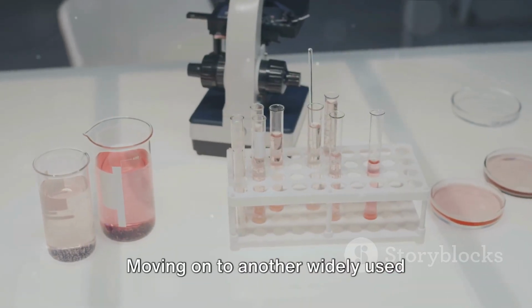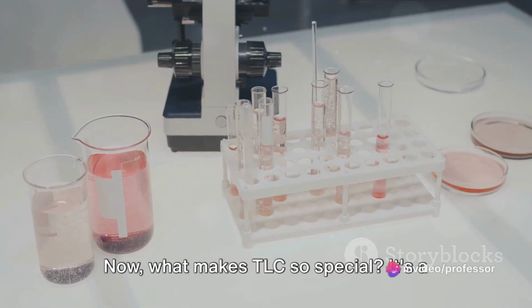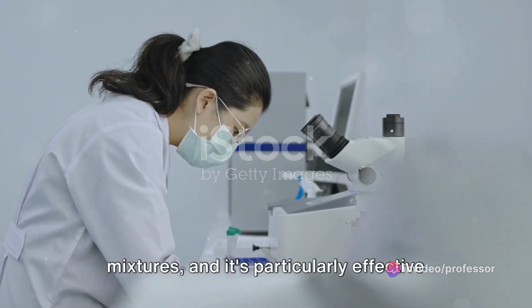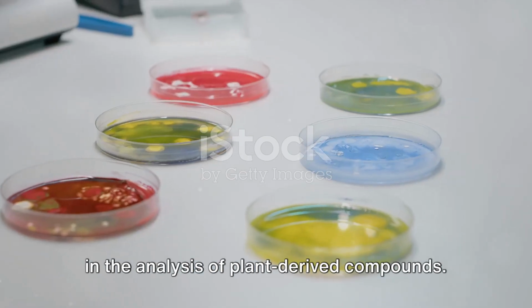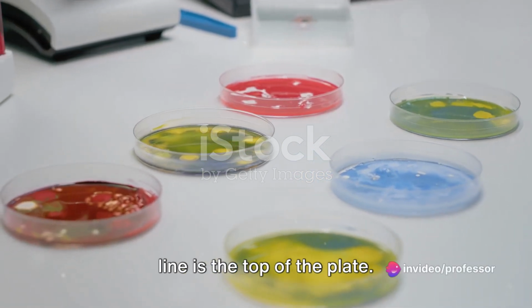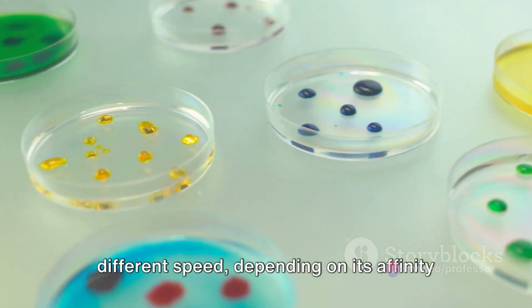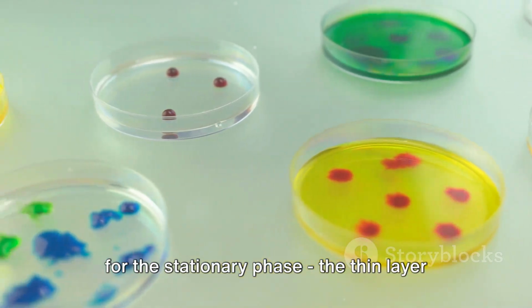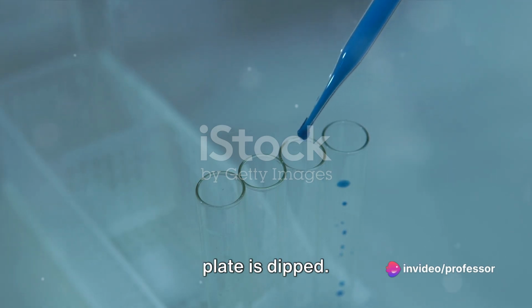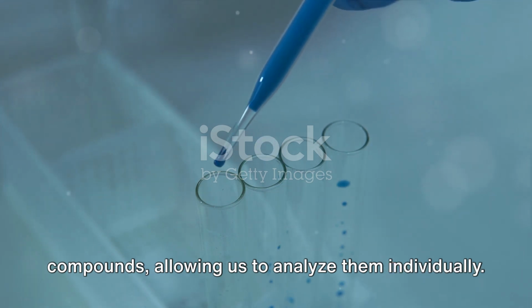Moving on to another widely used technique, thin layer chromatography, or TLC. Now, what makes TLC so special? It's a simple yet powerful method for separating mixtures, and it's particularly effective in the analysis of plant-derived compounds. Imagine TLC as a race, where different compounds are the runners and the finish line is the top of the plate. Each compound races up the plate at a different speed, depending on its affinity for the stationary phase, the thin layer of silica gel on the plate, and the mobile phase, the solvent in which the plate is dipped. This difference in speed separates the compounds, allowing us to analyze them individually.